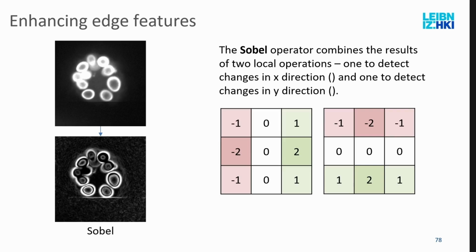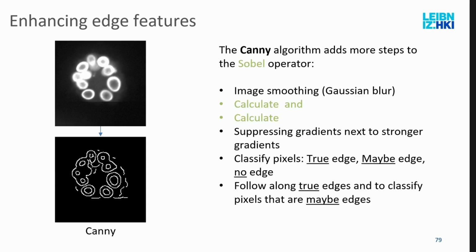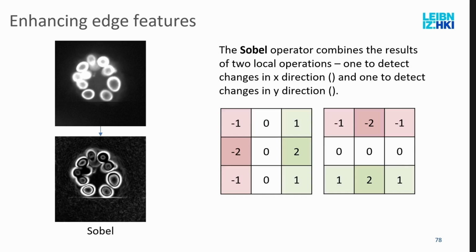This is the Sobel operator, and this actually has 2 different operations. So first you have one that is a filter kernel that goes in a horizontal direction. Again, when you sum all these values, it's 0. And then you have one that goes in the vertical direction, so X direction, Y direction. There's some formula missing. I don't know where it went. Somehow the formula got missing, a way to combine these together.